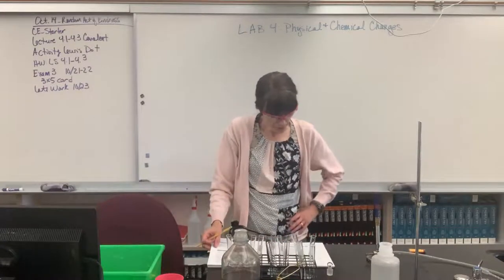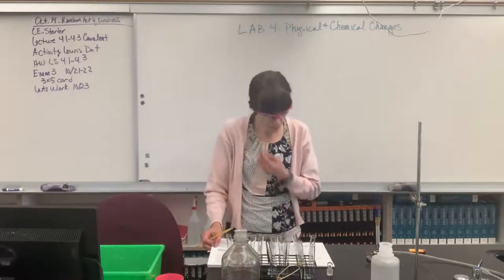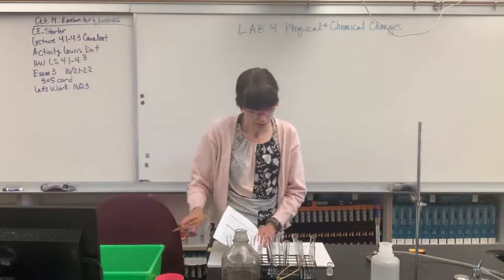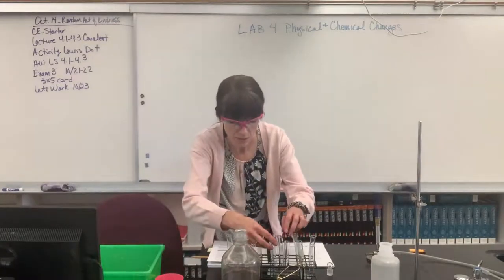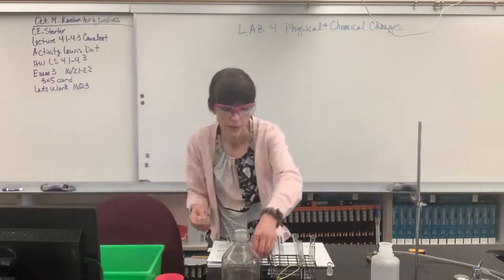Okay. So we finished number 9. Number 10, test the solution made from the melted sample the same way you did in steps 3 through 6. So let's go back to step 3. We are going to add 2 drops silver nitrate, which means I'm going to need a couple of test tubes to do this. I'm going to use these test tubes.